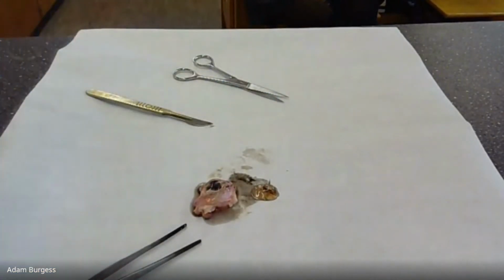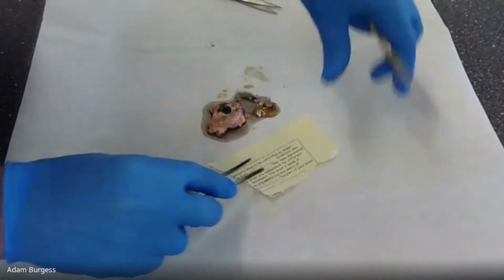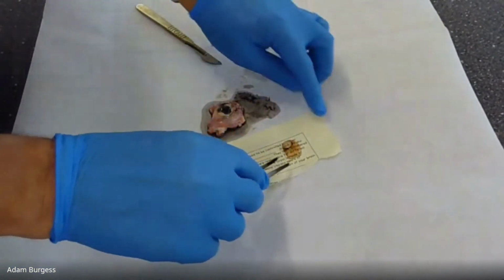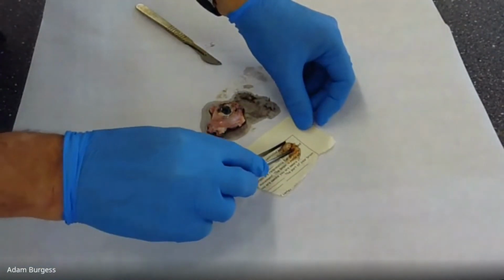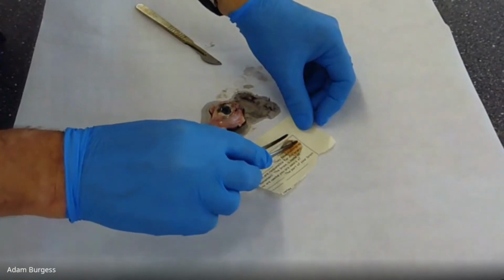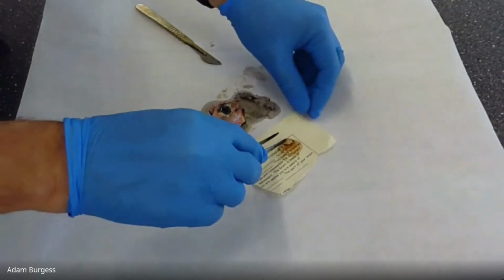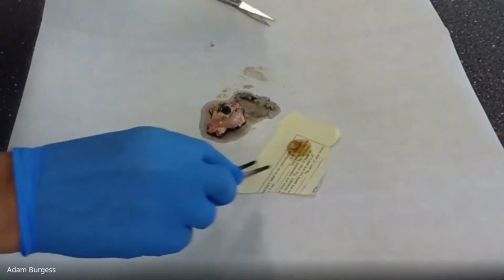So if I just get a piece of paper, what you can do is get the lens and stick it on a piece of paper, and you can actually make the words look bigger like that. Ooh, look. So that's a hard lens there. Okay, so that's the lens.